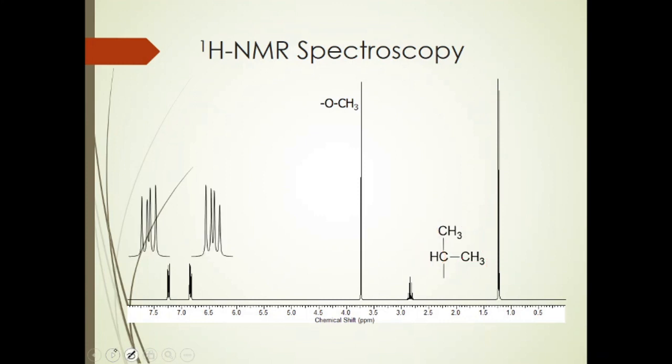So moving out to the aromatic region, if we expand it, we get these peaks here. There are 4 peaks, but these are not quartets. Again, a quartet is a 1-3-3-1 pattern. These outer peaks are not a third of the size of the inner. Also, the distance is not the same. These 2 inner peaks are very close together, whereas the outer and this adjacent inner peak, or this one here, are not equally distant. And so this is not a quartet.